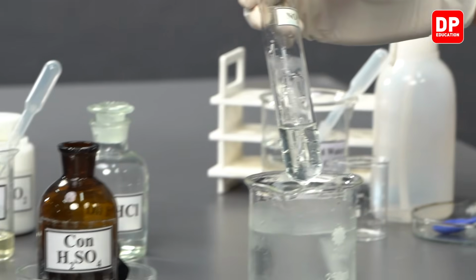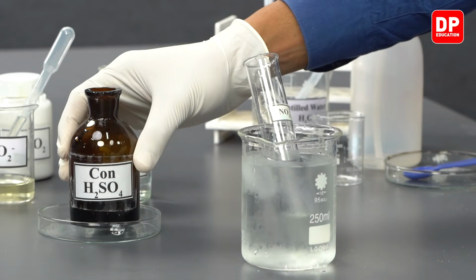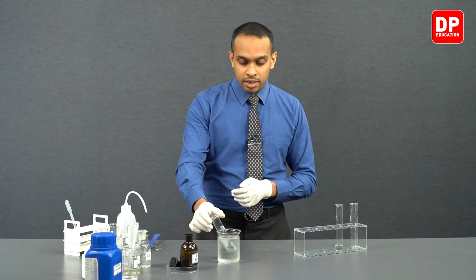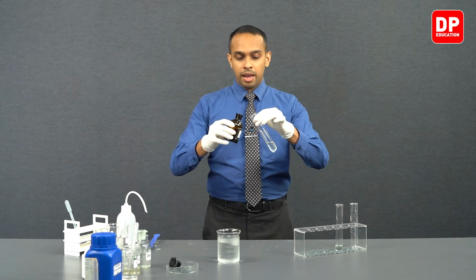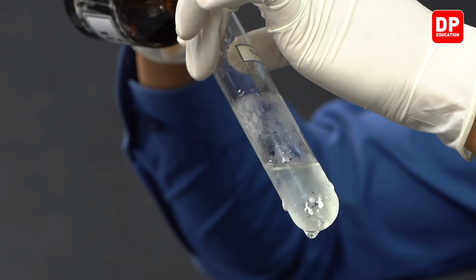So now we have allowed this solution to cool down for a while. We can now proceed to add sulfuric acid to this boiling tube, and when we are adding sulfuric acid, we are going to make sure we add it in such a way that it is running down the wall of the boiling tube. So let's take our reaction mixture here along with sulfuric acid, and we will take care to add sulfuric acid along the wall of the boiling tube little by little.